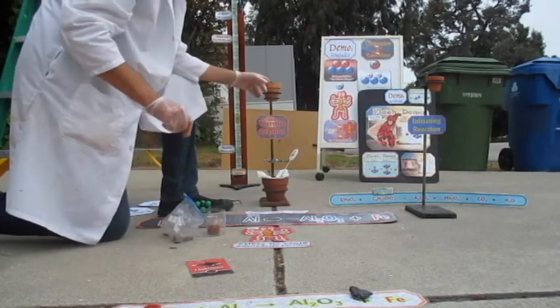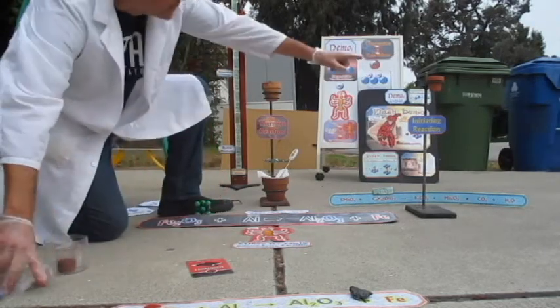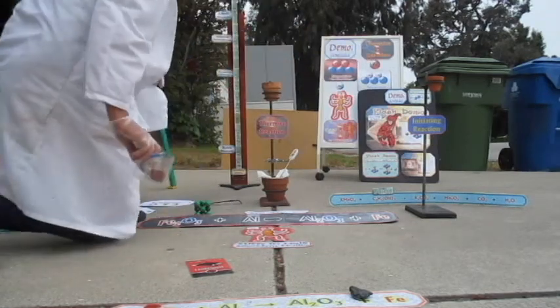So this is the main reaction, but before that, we're going to try a little side reaction, the initiating reaction. That's the first one, the initiating reaction.